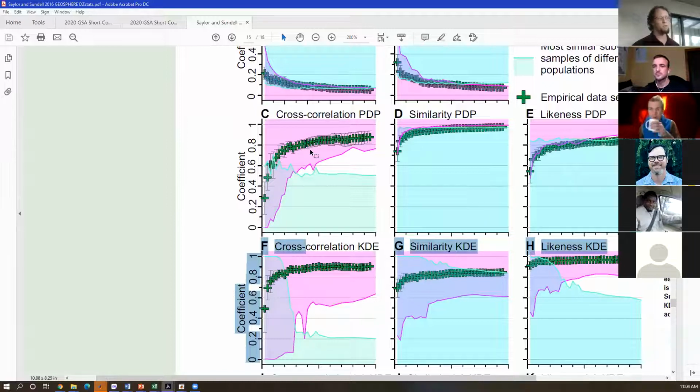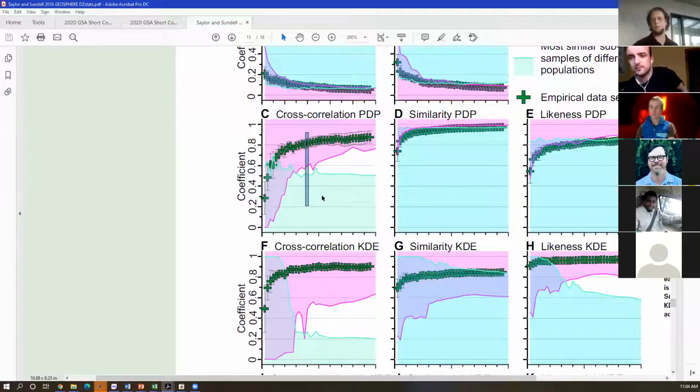And so really the most robust interpretation would be, let's say I have 400 grains and I've got a bunch of samples that string out anywhere from cross correlation coefficients of 0.9 up here down to 0.2. What you can say for sure is, well, these guys up here at 0.9 are a lot more similar and are probably more likely to be drawn from the same population than these guys down here at 0.2. But again, it's a relative comparison rather than an absolute sort of hypothesis test. Yeah. Okay. Yeah.